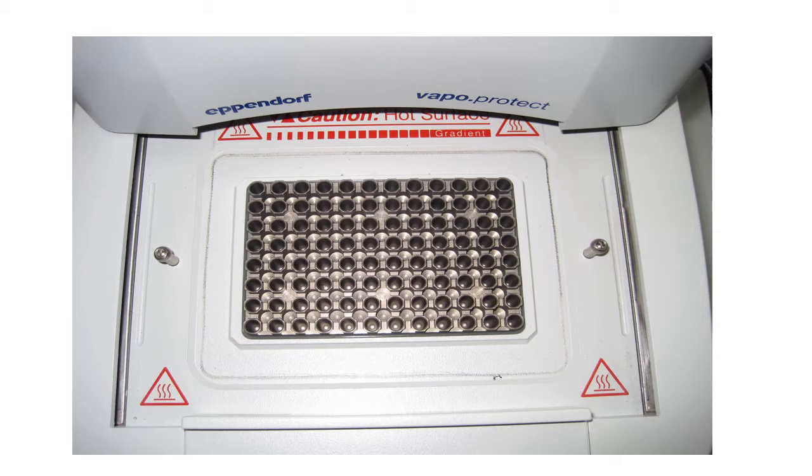We learnt that the caution hot surface sign is there because the heated lid of the machine presses against the lid of the tubes to prevent condensation.